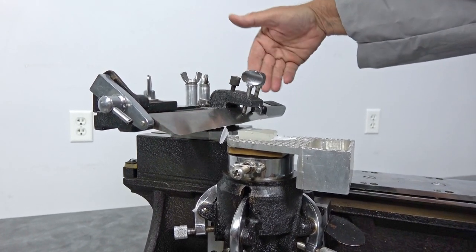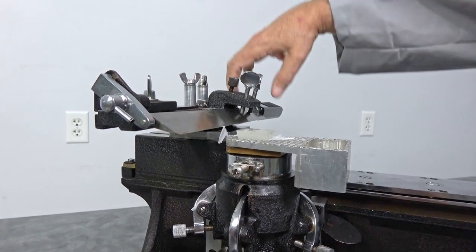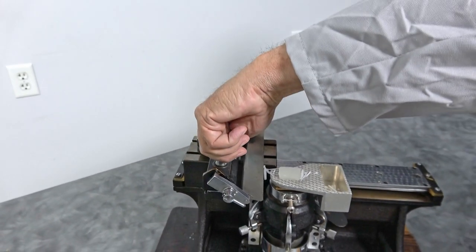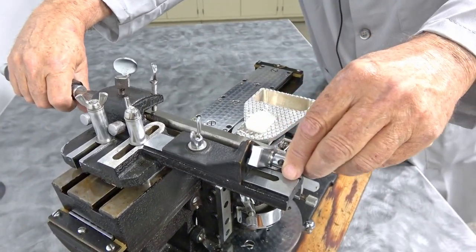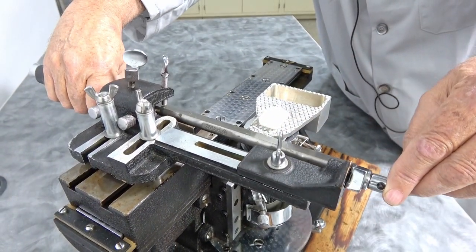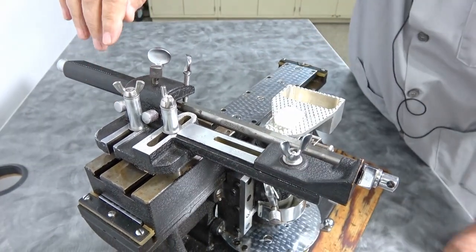When you want to change your blade to get to a new sharp section you can do that as well. Loosening up the levers, sliding that along so you can be refreshing your blade, your section of where you're on the blade.